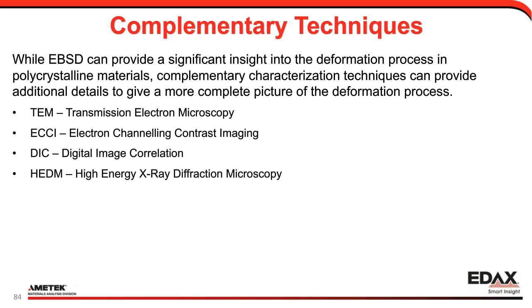So let me look at 4. There are others. Transmission electron microscopy, kind of going in order of different resolution here. ECCI, electron channeling contrast imaging. DIC, digital image correlation, or HRDIC is what I'm going to focus on, high resolution digital image correlation. And HEDM, high energy X-ray diffraction microscopy.